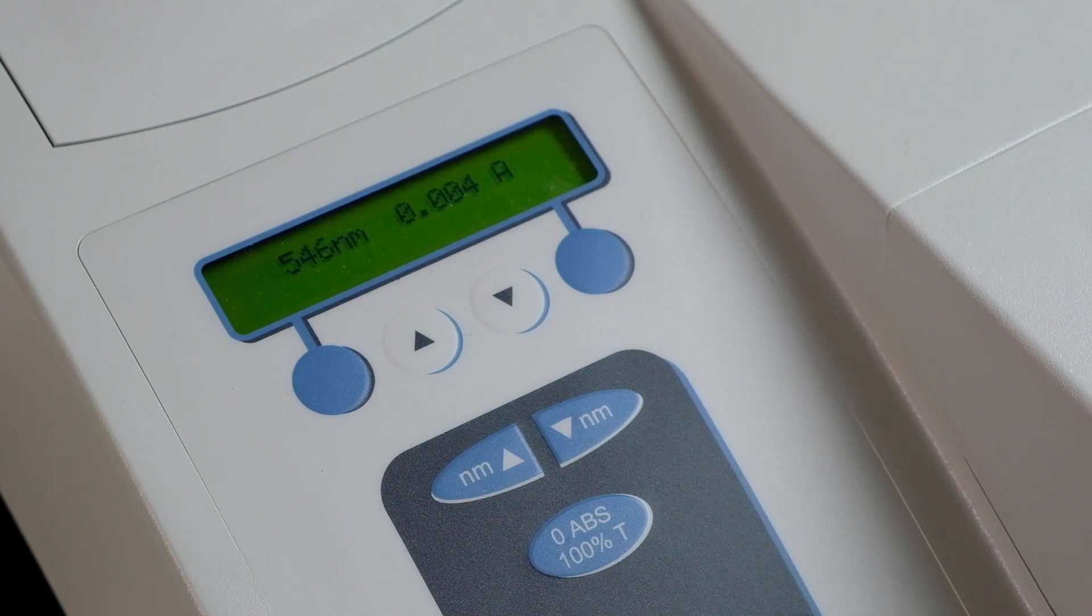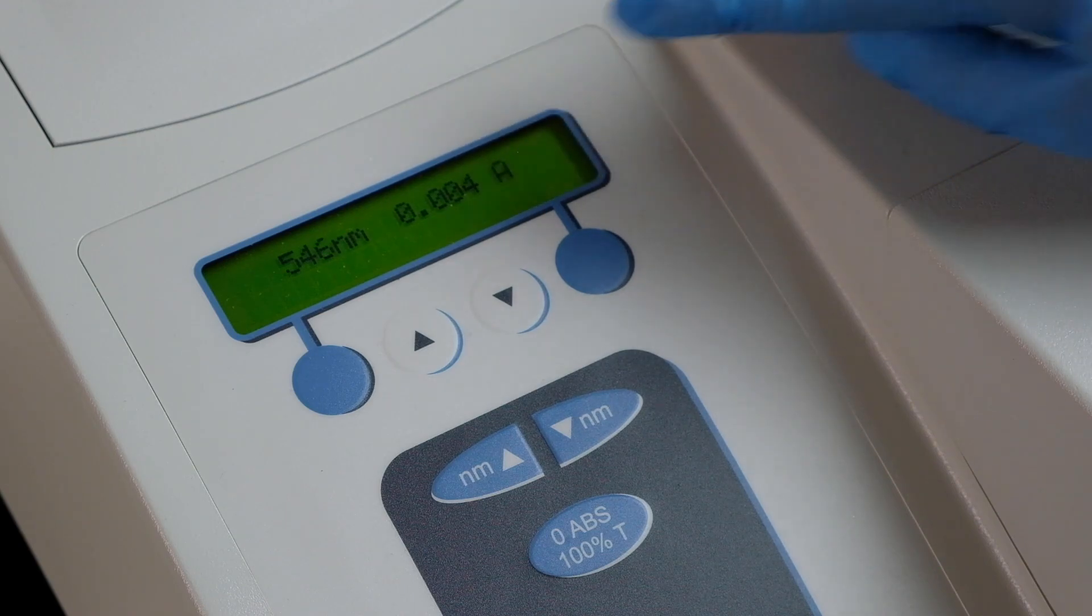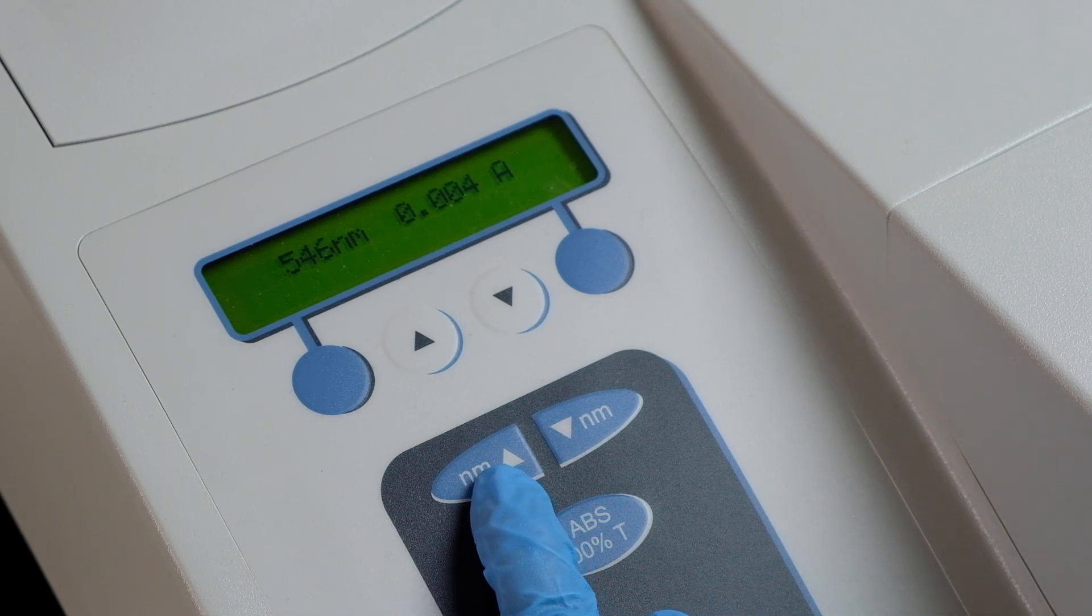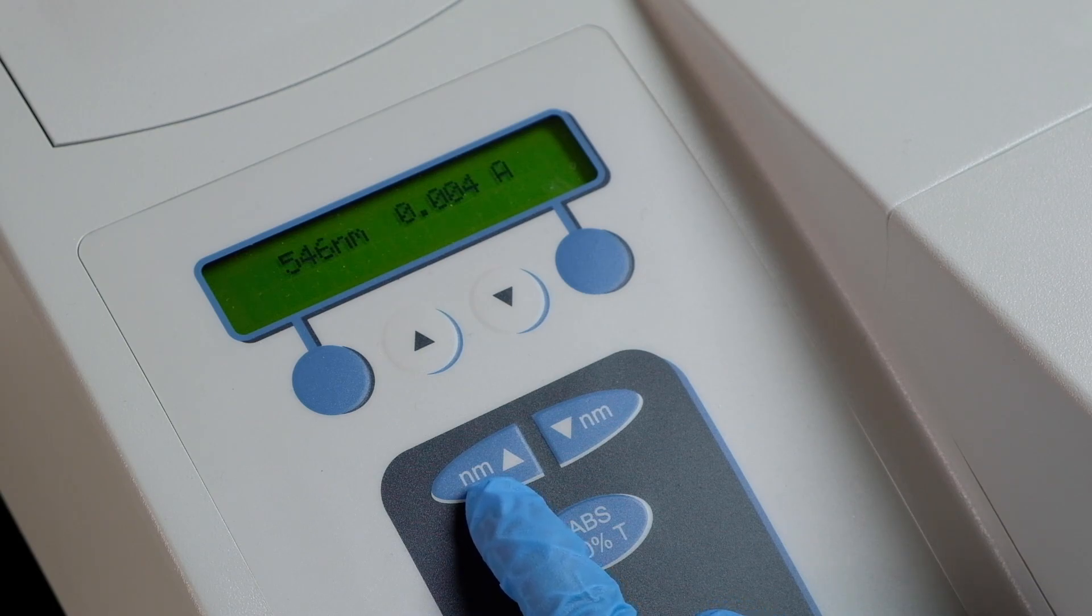With this, it's sufficiently warmed up already. First, you want to make sure that your setting is at A for absorbance. Second, you want to set your wavelength to the wavelength of choice. We start at the wavelength of 380 nanometers. So use the up or down buttons right here to adjust to the wavelength of choice.